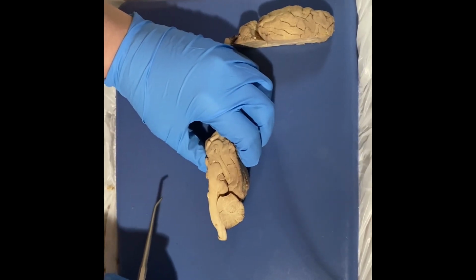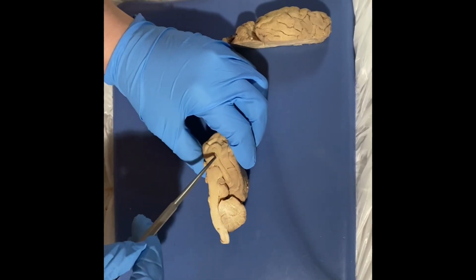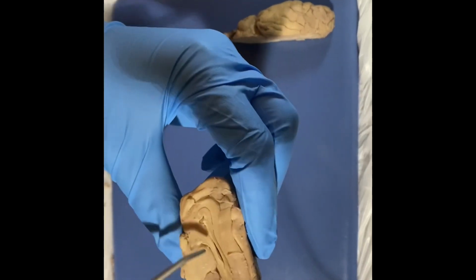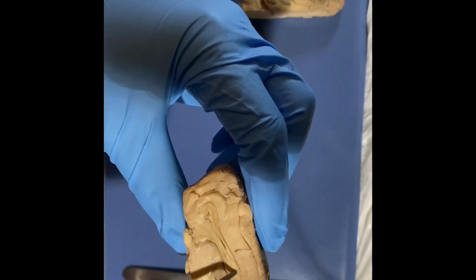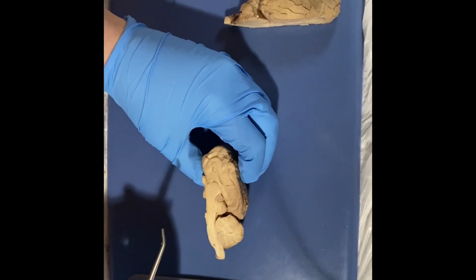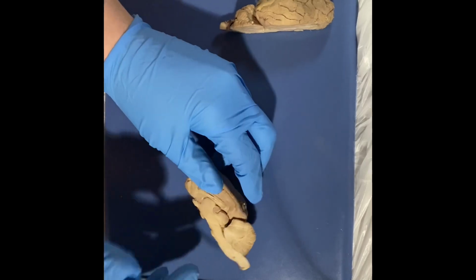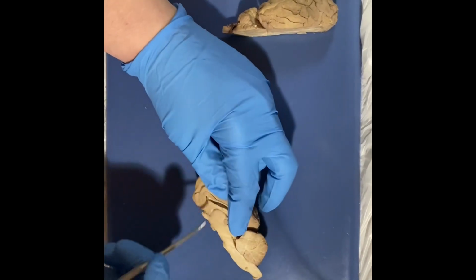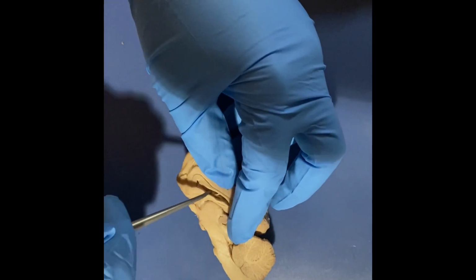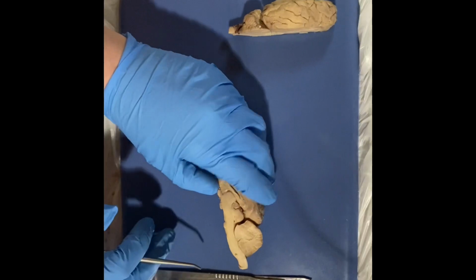Then we have the corpus callosum, which is nervous tissue that connects the two hemispheres together. It's the thicker part, the outside of that. Then we'll go inside to the septum, which holds the first and second ventricles, which is white matter. And here we see the first and second ventricles.